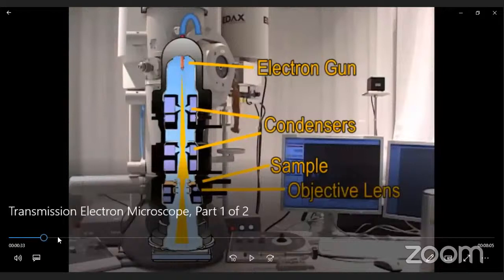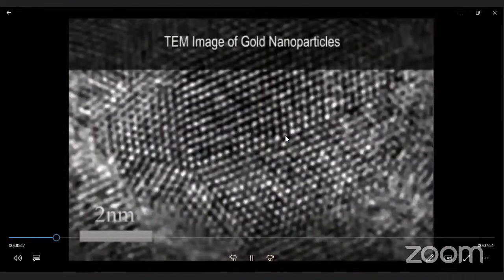Now you see, this is the sample holder, and this is the grid that is being placed. Okay. This is the grid on which samples are placed. Now this grid will be inserted into the tube. Mind that this electron column is evacuated. Okay, and we have to enter this sample into it, and we're just putting liquid nitrogen over here.